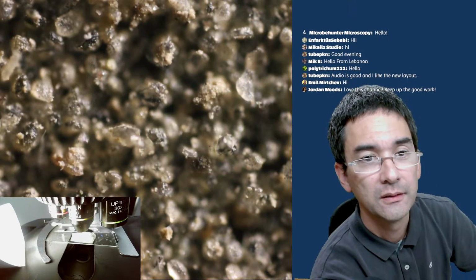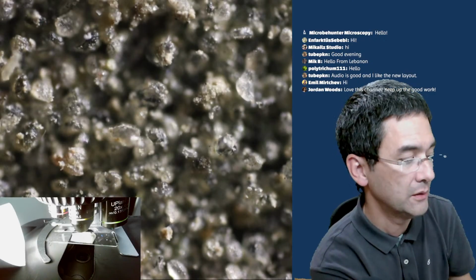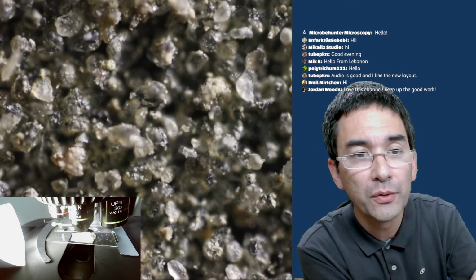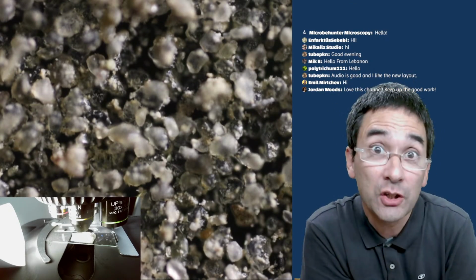Maybe a slightly higher power. Okay, no, that's enough. You can see that actually it looks a little bit more natural. Yeah. So this is indeed something that you might also want to try out. That's actually why I'm showing it to you.